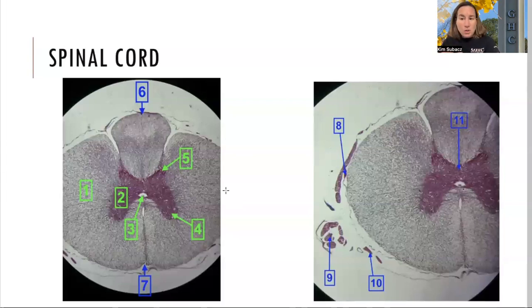And the area where the soma was, the cell body, remember that didn't have all the myelin sheath around them. And so that stuff was darker colored. And so that's going to be the gray matter. So we got gray matter. All of this is the gray matter. And then all of this stuff is the white matter, all this lighter stuff. So let's knock that out. Gray matter and white matter.